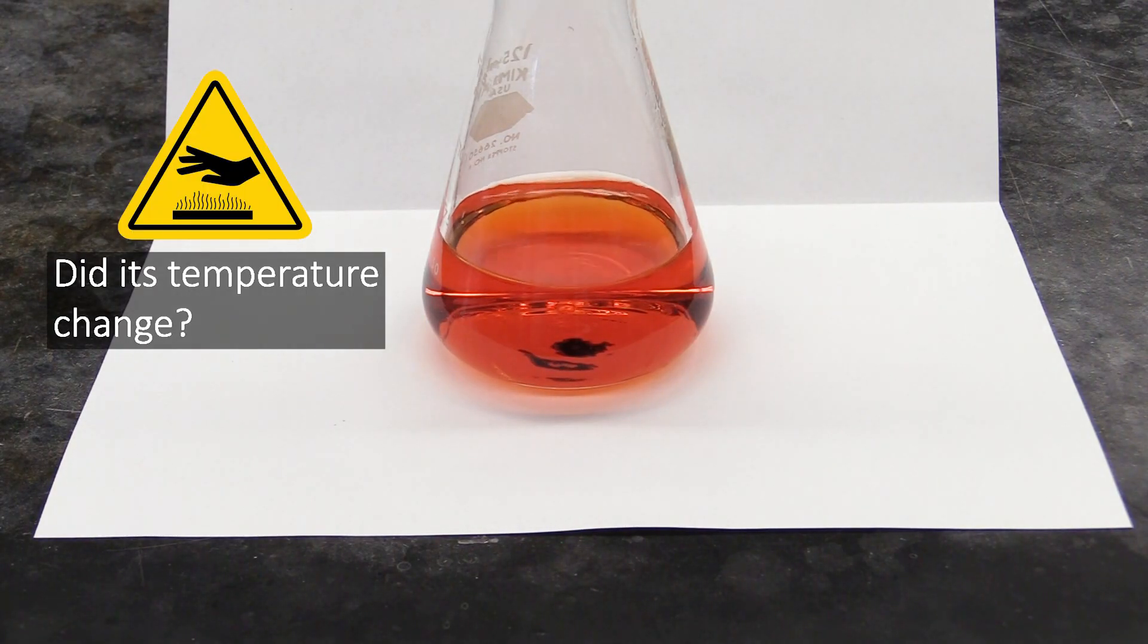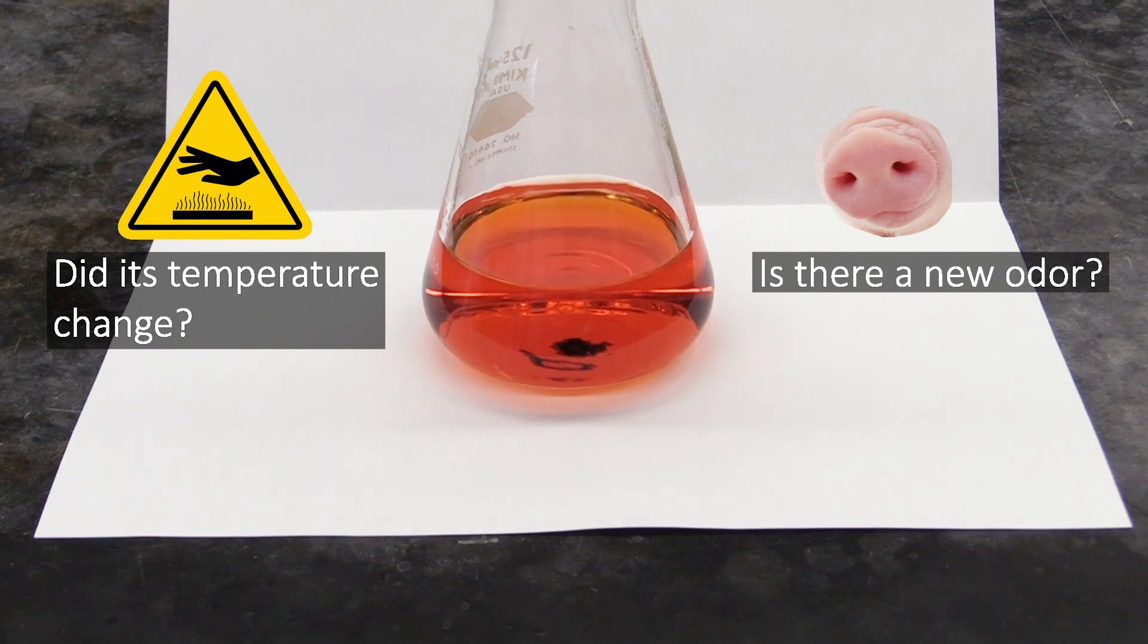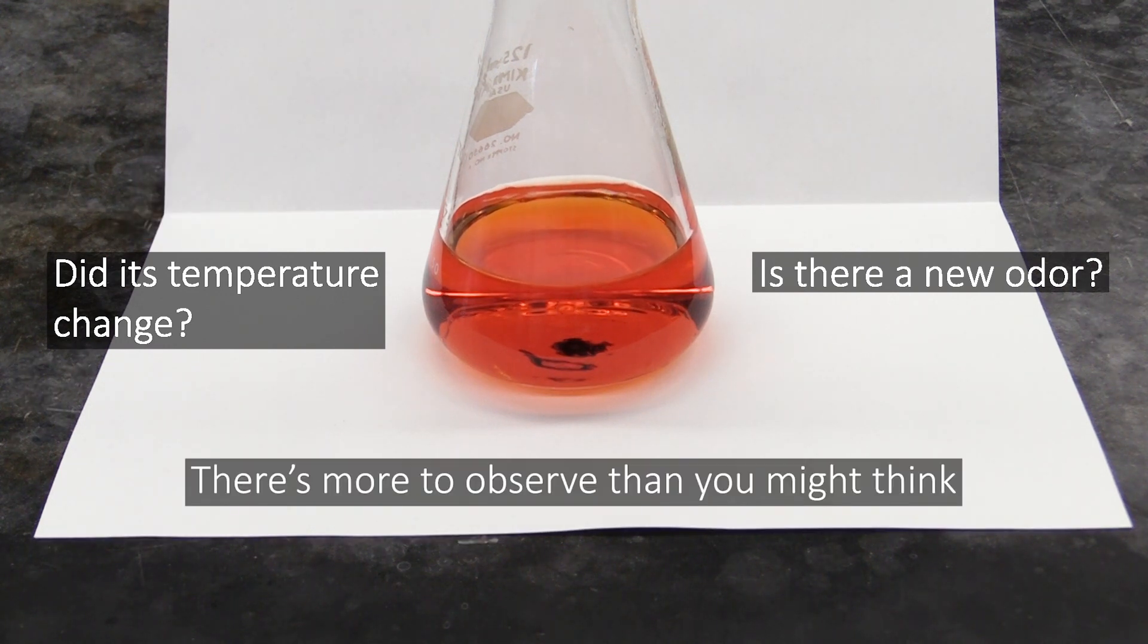You could also feel the flask and see if it changed temperature, or smell the contents and see if their odor changed. The point is, when making observations, you want to keep your senses open and note as much as you can.